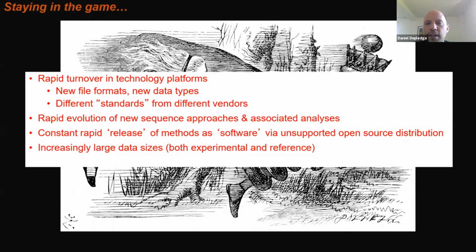The other challenge you will find from more of an informatics point of view is there is so much software out there, most of which is only used a few times and then dropped. Others of which are very popular in the wider community, but are often updated. And a lot of them tend not to be very well supported because they're open source distributions and they don't have dedicated people who can spend their time fixing every little bug or updating the software to work with every new little bit of technology that's released.